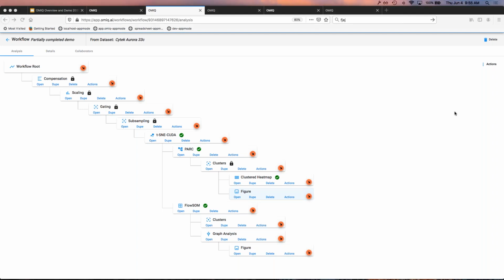Another one, there's a few questions around file size and size of experiments. Specifically, how does OMIQ handle the simultaneous analysis of big data files on the order of hundreds of megabytes? And these experiments are meant to identify rare cell subsets. Do you have to do a lot of downsampling? Does it take a long time to compute? If you could speak a little to that.